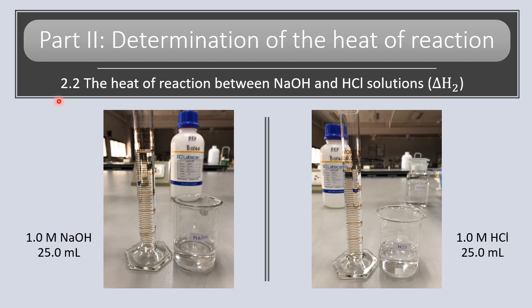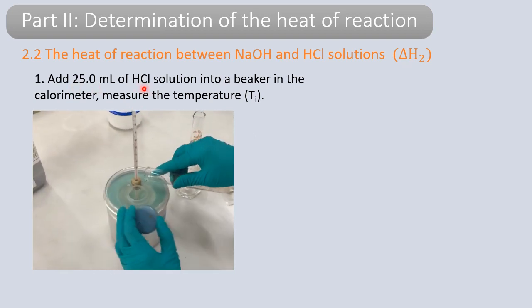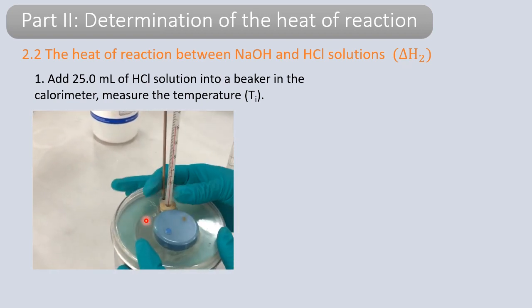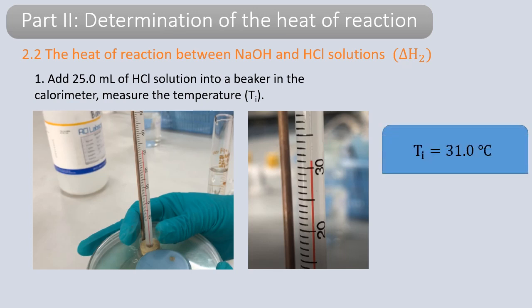Then move on to part 2.2: the heat of reaction between sodium hydroxide solution and hydrochloric acid solution — this will be our delta H2. We use 1 molar sodium hydroxide (25 ml) and 1 molar hydrochloric acid (25 ml). Add 25 ml of hydrochloric acid into the beaker in the calorimeter first and record the initial temperature Ti. The result: Ti is 31 degrees Celsius.